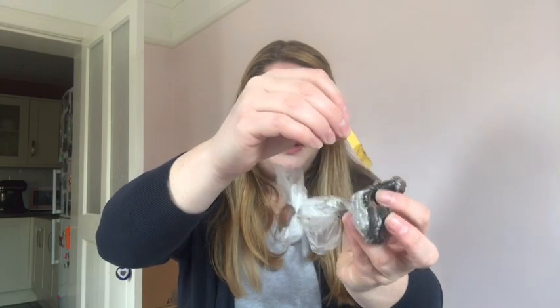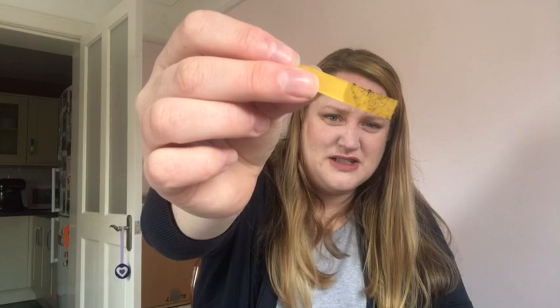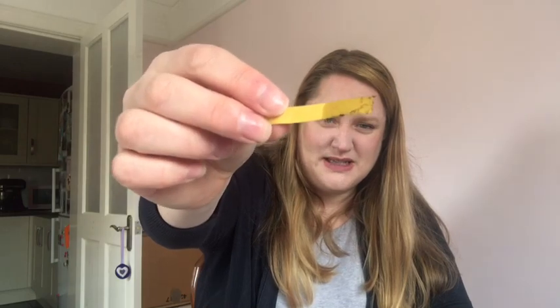Yeah, there's enough moisture in that one. You can see it's made it wet. It's not really started to change colour at all, so we'll give it a minute and see what happens. But that's sample number 7.